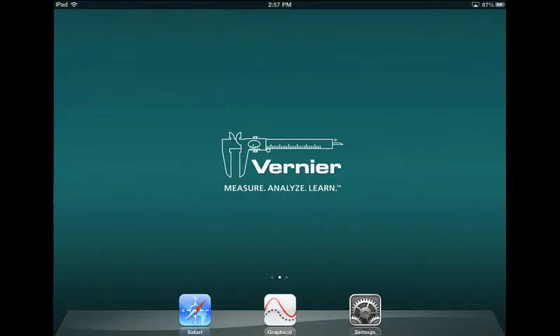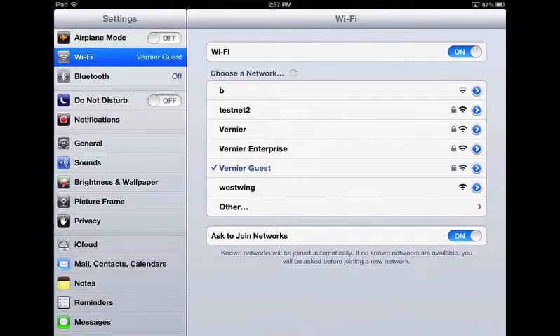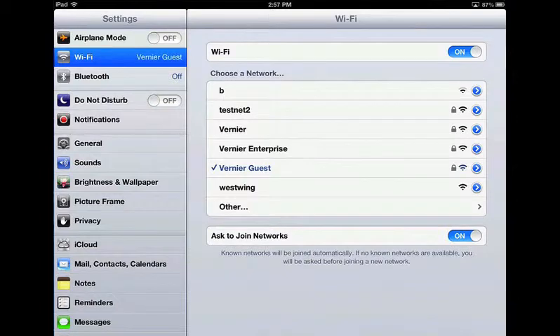Launch the iPad Settings app. Verify your iPad's Wi-Fi is on and connected to the correct network, which for me is Vernier Guest. Note that it is not necessary for your network to have internet access when sharing data.